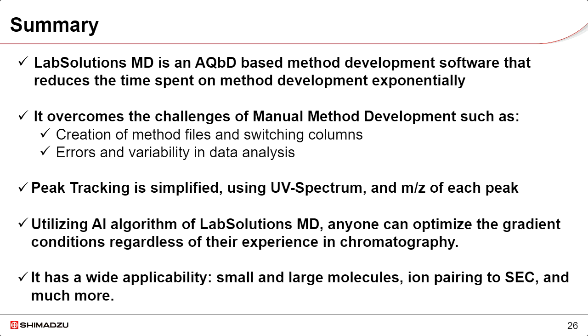When we combine the technologies of LabSolutions MD with photodiode array data and single quad mass spec data, we have very efficient and simple peak tracking. And using that AI algorithm for optimization of the gradient can allow for very sophisticated gradient conditions to be generated without any user intervention.